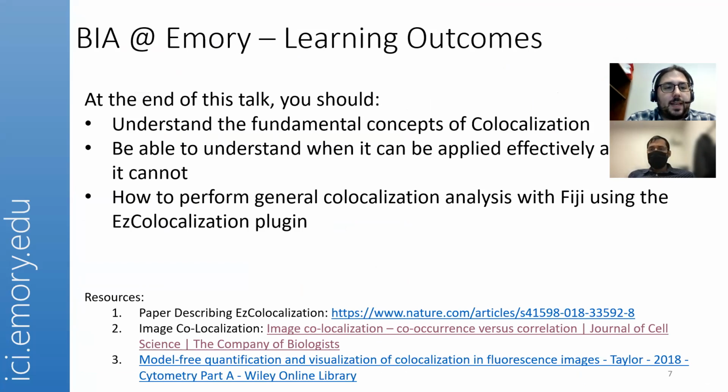But what should you know by the end of this course, or have a better understanding of if you already have some background in colocalization? You should understand fundamental concepts and especially how to apply them. We'll go over a number of coefficients, all of which tend to add something to your understanding of how the data is interpreted and how the components interact with each other, none of which is useful really by itself, absent a deeper understanding of its function and utility.